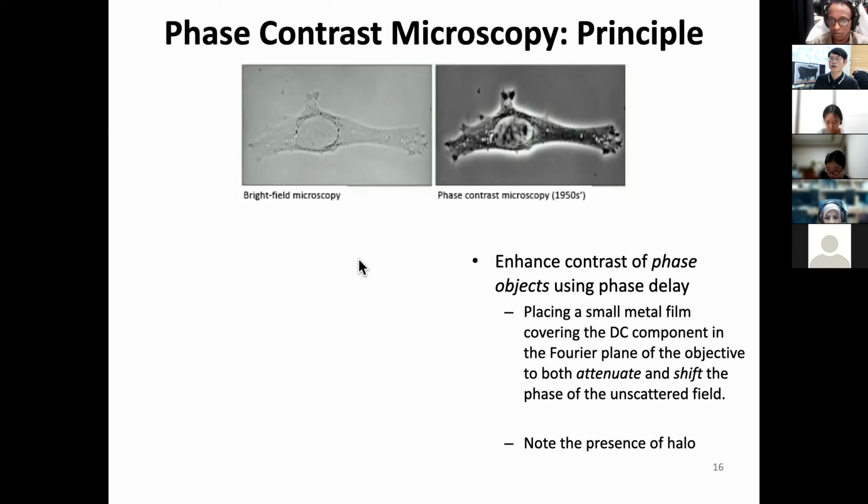Okay, so go back to the mathematics again, what's happening in this bright field. This is almost constant intensity as a 1, and the other, you see something very interesting variation. And even you can see sometimes a halo on the backside of the set. Isn't it curious?